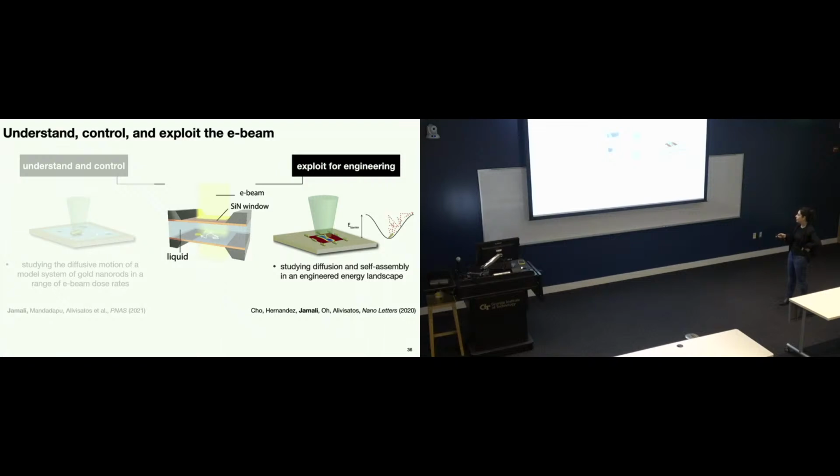To give you an intro to why we are thinking about this problem, I'm going to talk about a collaborative work that I started doing in my postdoc, which was on using the electron beam to tune the assembly of nanoparticles. Not just assembly, but literally also the motion.